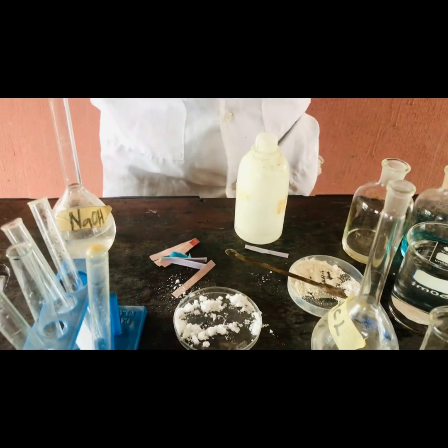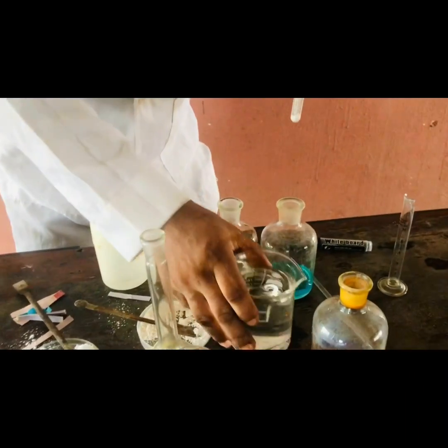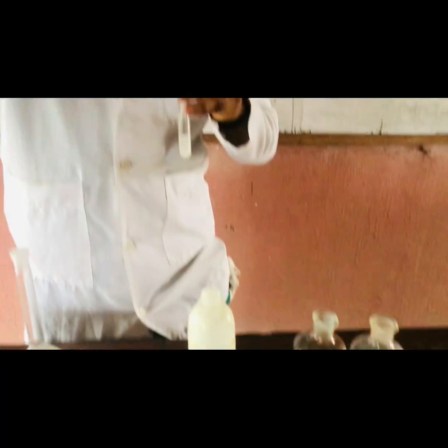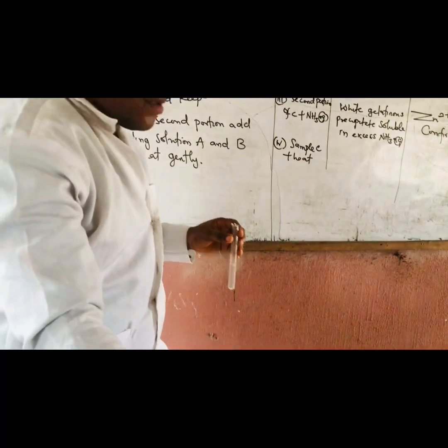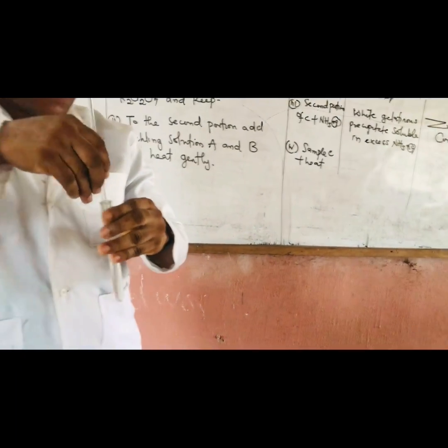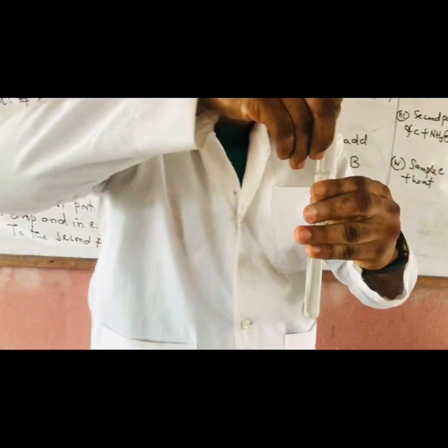Put a little. This is my water. So let's shake. What did they ask us to do? They said stir. Okay, let me stir with my glass rod.